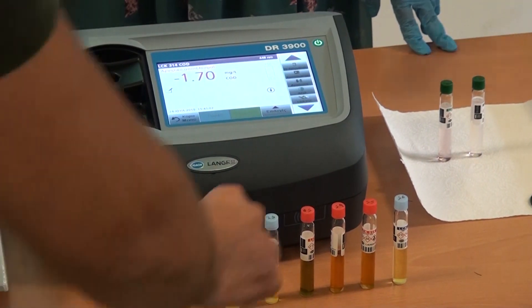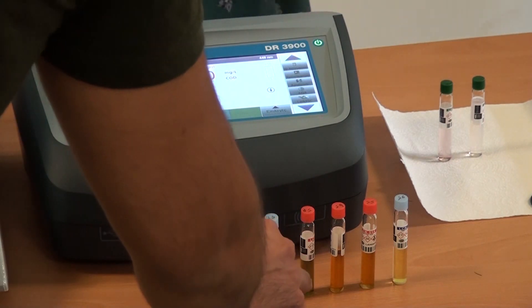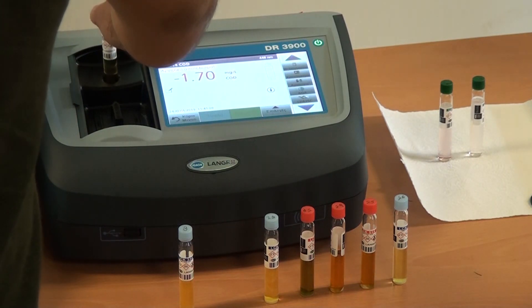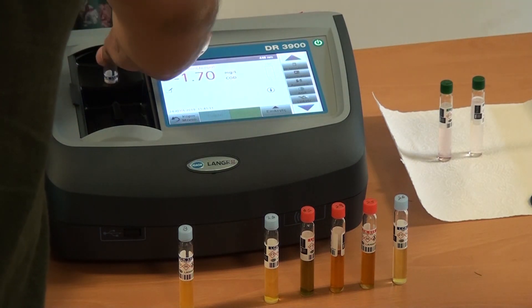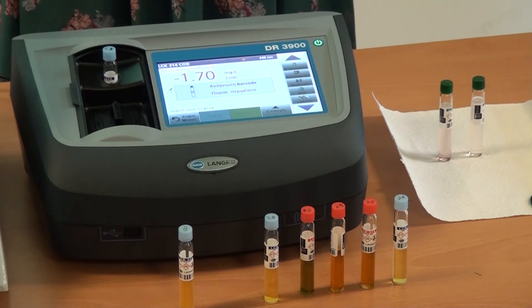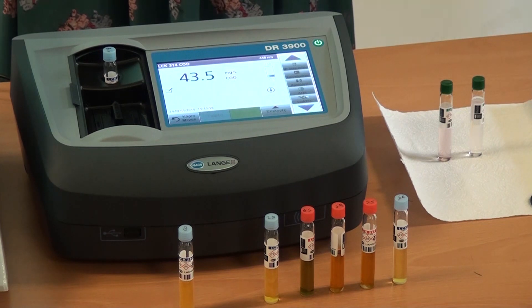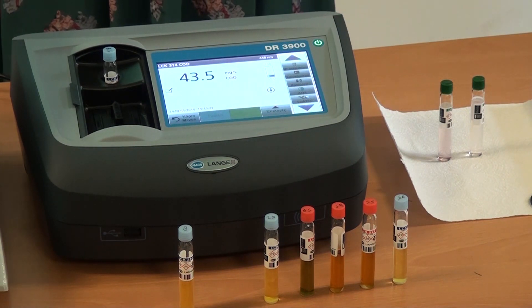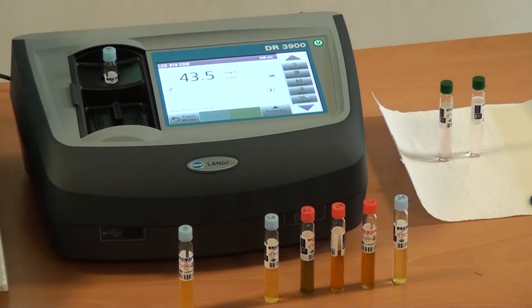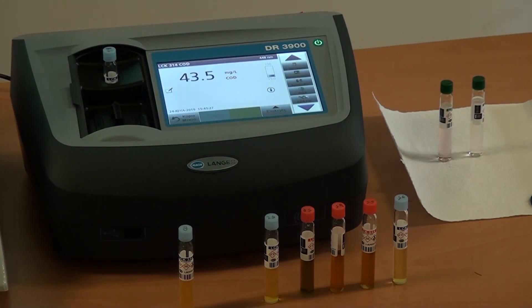What do we expect from this one? Let me remember — somebody was taking notes. Okay, 50. Yes. 30. Okay, 43. 50 plus or minus 6. Yes. So we are good. Very close.